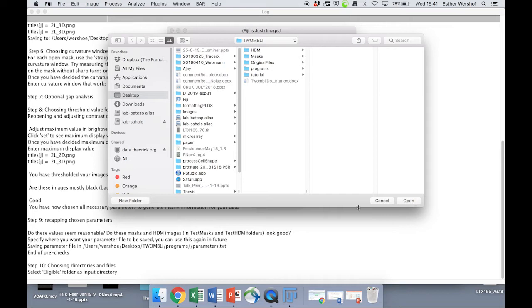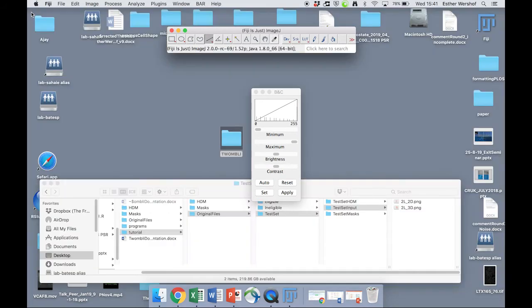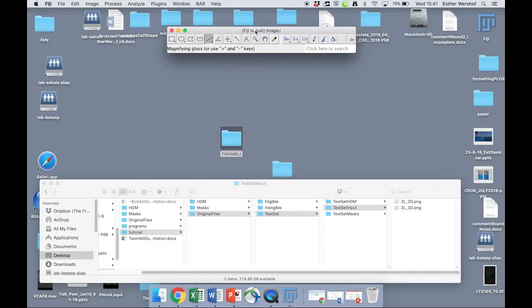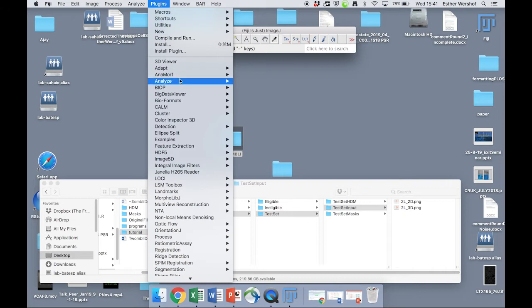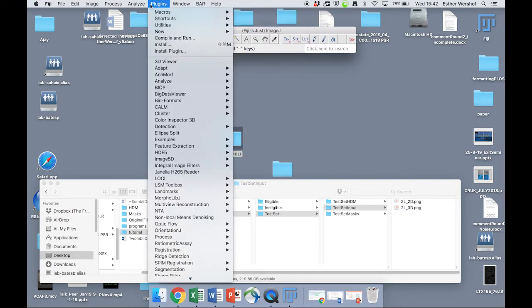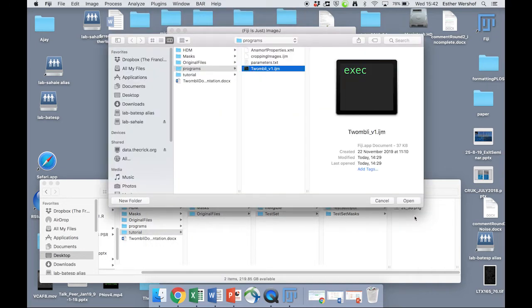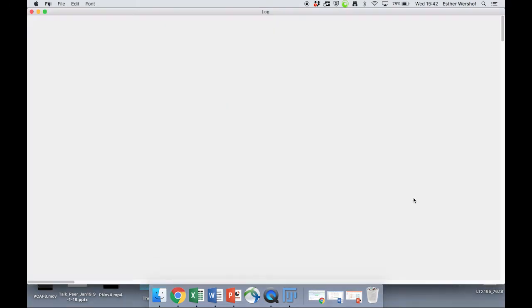And supposing, for instance, either we come back to this later or we messed up somewhere a bit later on. So I'm going to actually quit the macro for now and rerun it. You don't have to do this, it's just to demonstrate how we can use that parameter file that we've now saved.